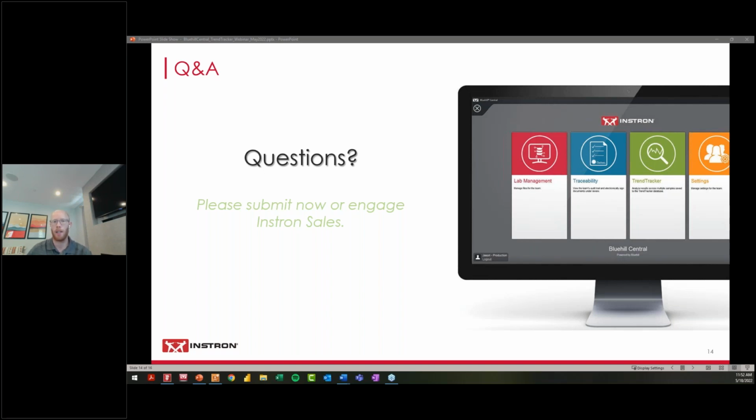Another good question, but the answer to that is no. The equipment that can send data to our TrendTracker database is our Instron equipment, and our Instron equipment that has our TrendTracker plugin capability to communicate with that specific database. Again, that is an item that we've heard in the past, but if you want to send all of your data associated to that sample from different test equipment, not just Instron equipment, that's when you'd be looking at kind of a LIMS situation, where we have all of your test equipment getting pushed to a database, to use a kind of third-party application that Instron hasn't developed.